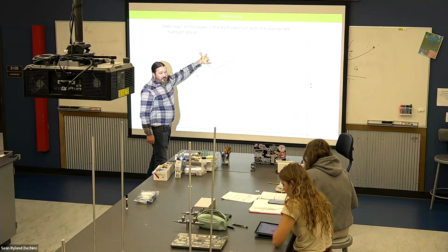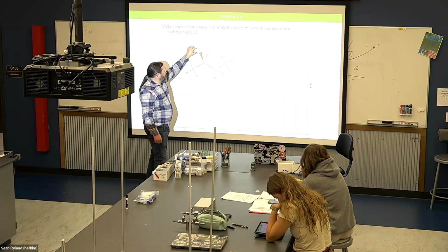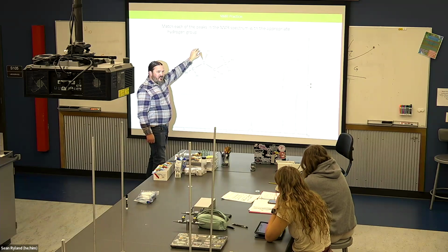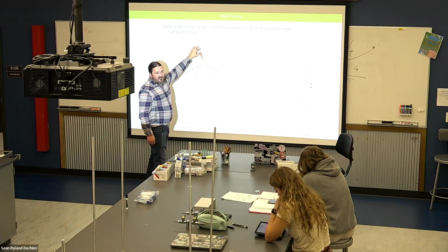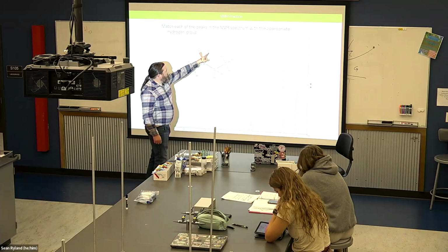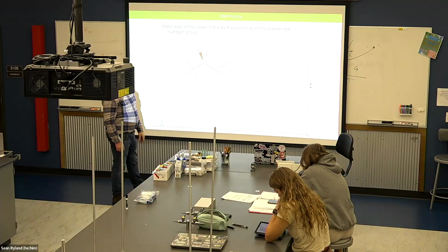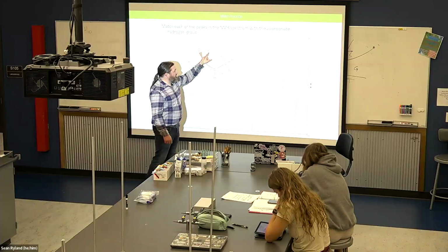Yeah, this hydrogen is the most de-shielded because it's attached to a carbon that also has a chlorine. Chlorine's the most electronegative, so it's pulling electrons towards itself. The hydrogens closest to the chlorine should be the most de-shielded. And how many nearest neighbors does that hydrogen have? That one has 5. 1, 2, 3, 4, 5.